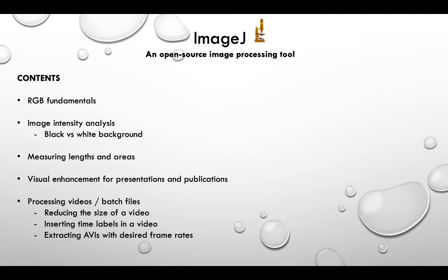Hey guys, welcome to the tutorial on ImageJ. ImageJ is an open source image processing tool that we use extensively in our lab. So the purpose of this video is to familiarize you with some of the basic operations that you will need to do quite often during the course of your research.